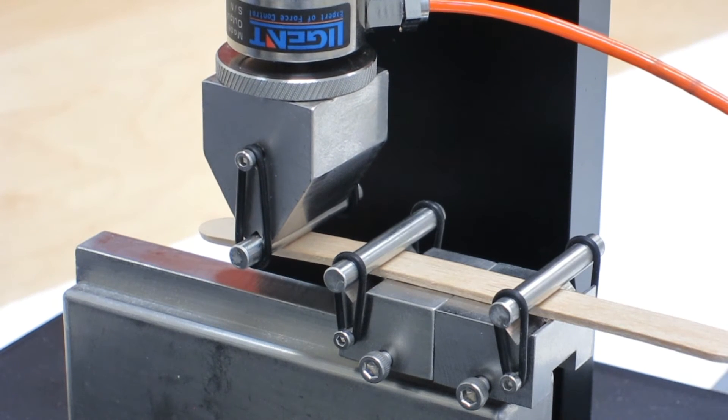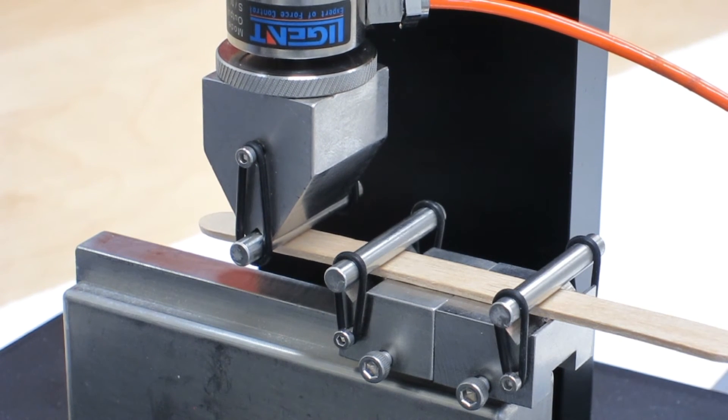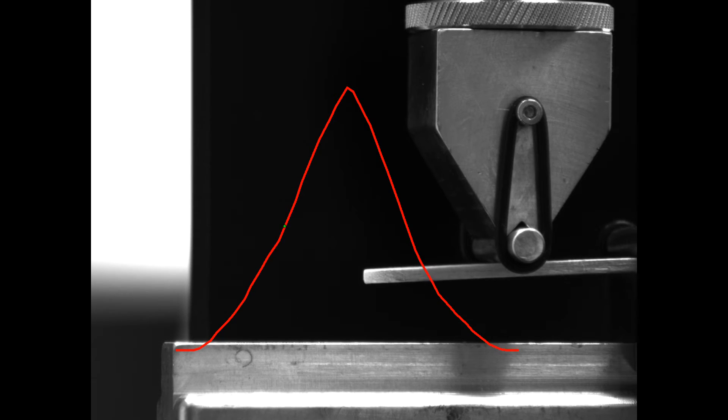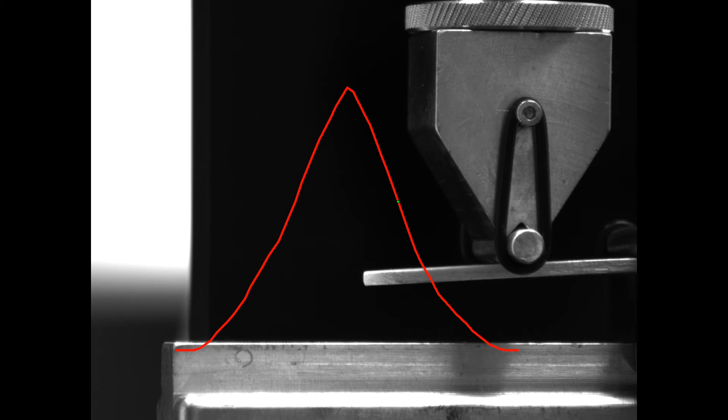Let's take a look at one final test mode. Here we're seeing a cantilever bend test on a popsicle stick. The force is about 30 newtons and the displacement is about 2 millimeters.